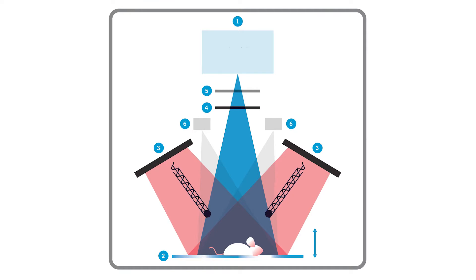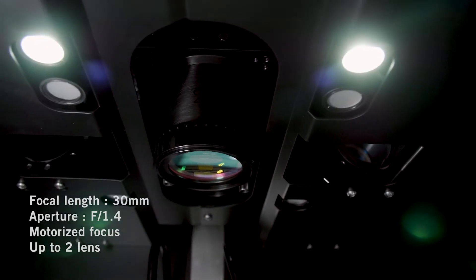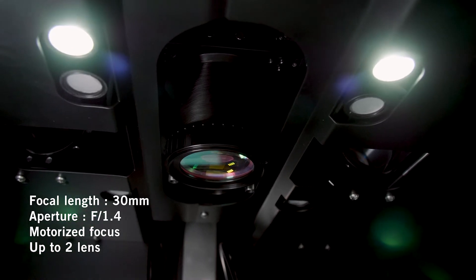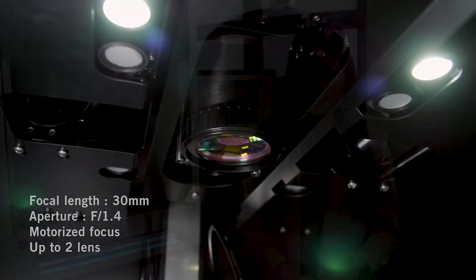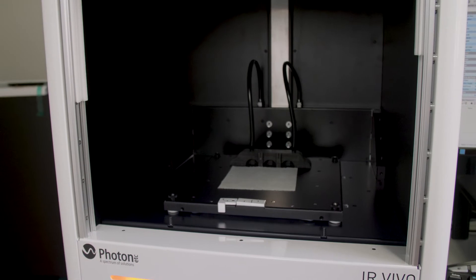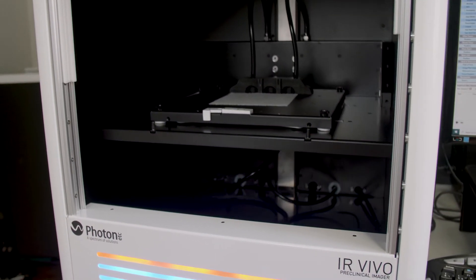So once the light hits the markers in the mouse, it emits fluorescence and it goes back to our lens system. The way we designed our lens system has a focal length of 30 millimeters and an aperture of 1.4. What's nice is that you don't have to worry about being in focus or not. We have designed an automatic motorized focus so you always stay in focus.